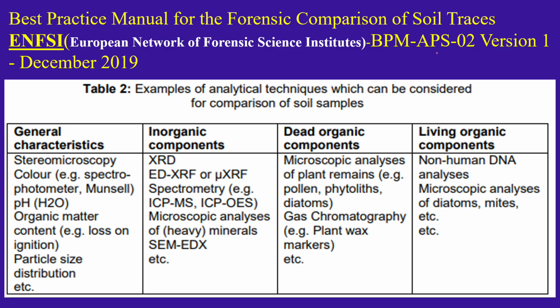Another important manual I brought is from ENFSI, the European Network of Forensic Science Institutes. They prepared a manual procedure, and they have mentioned examples of analytical techniques which can be considered for comparison of soil samples as per the ENFSI standard.